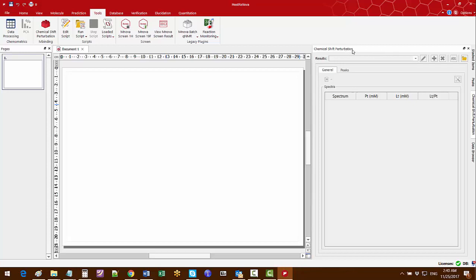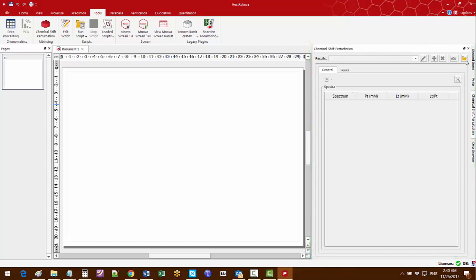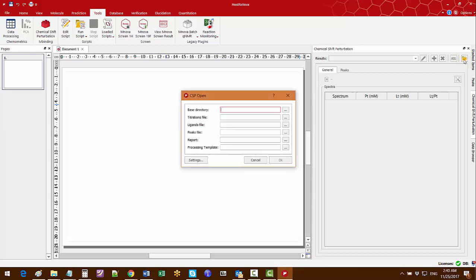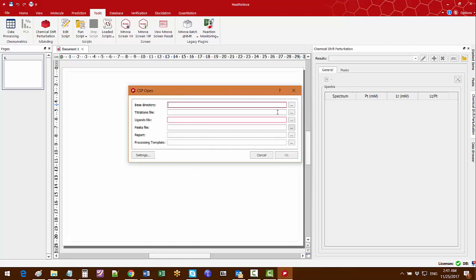I bring up the chemical shift perturbation panel. I click the CSP open tool to enter the base directory where the titration spectra are located.